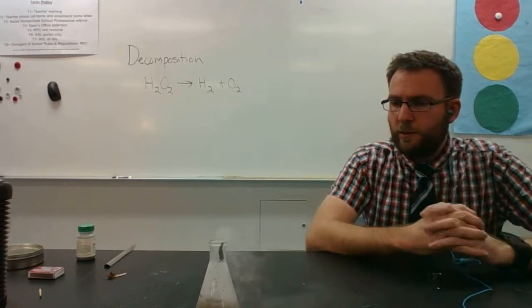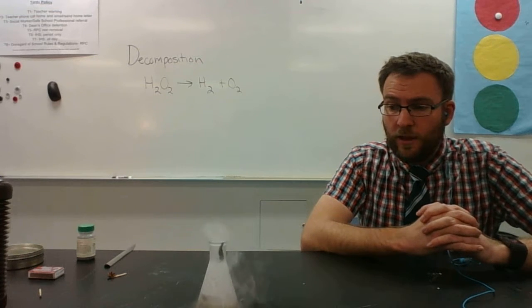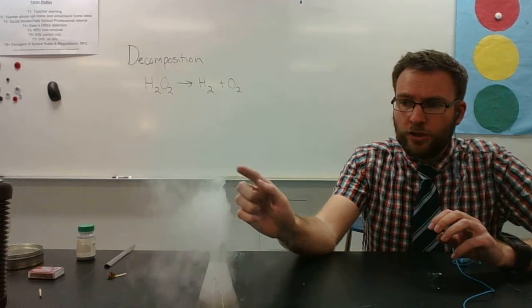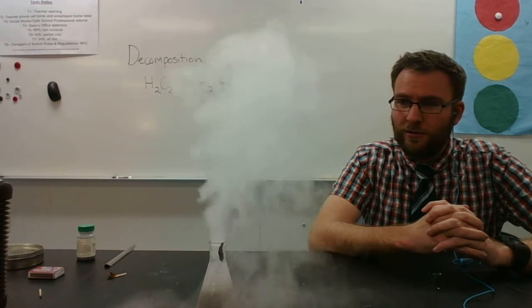Well, it's not as explosive as I'd hope it'd be, but you can definitely see that the hydrogen peroxide is releasing gas, okay? What it's releasing is the hydrogen and, ooh, there it goes. That's much better.